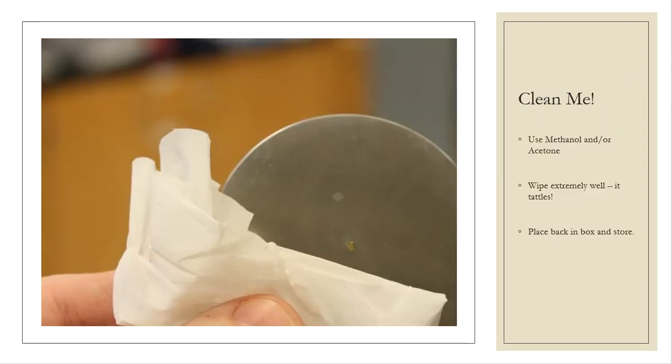All right. One thing I also don't want you to forget is always clean the plates when you're done. So we clean them with methanol or acetone. They make very good organic solvents. So methanol, acetone, maybe both. Just give this plate a very good wipe down because we want that $18,000 diamond right there to stay clean.